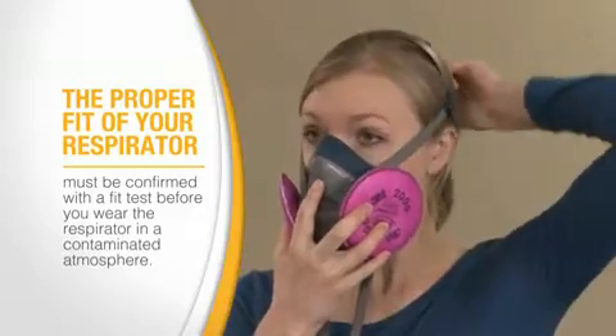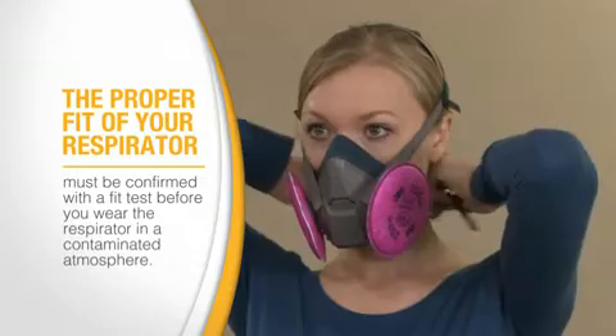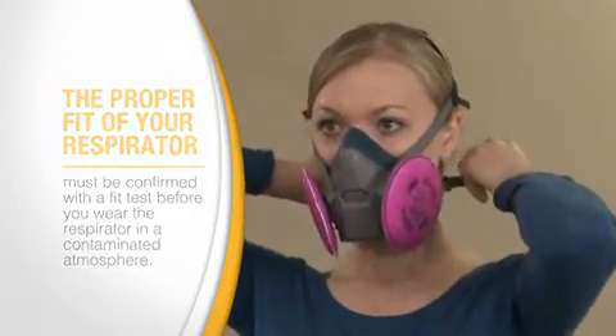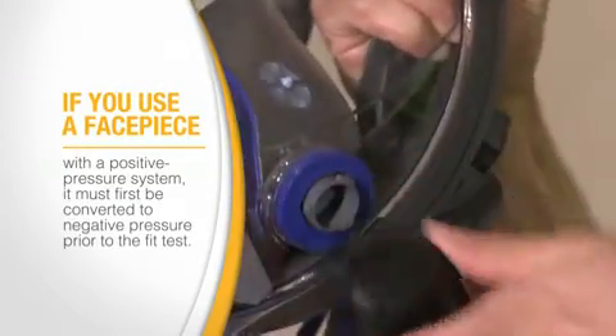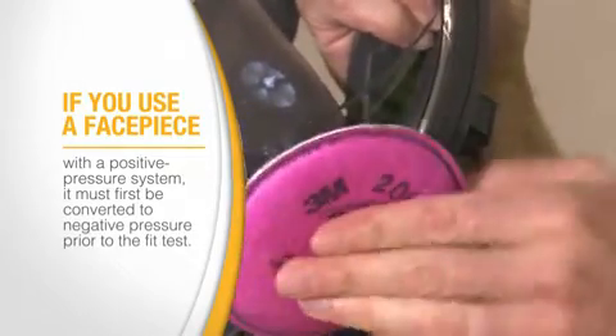The proper fit of your respirator must be confirmed with the fit test before you wear the respirator in a contaminated atmosphere. This must be done for all tight-fitting facepieces. If you use a facepiece with a positive pressure system, it must first be converted to negative pressure prior to the fit test.